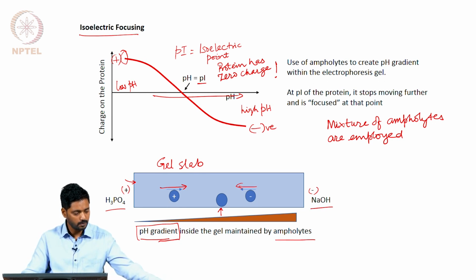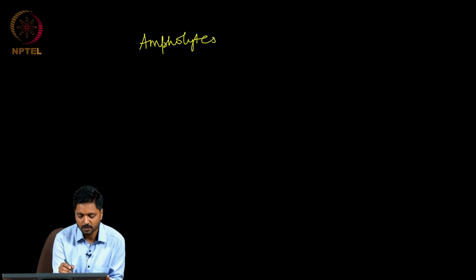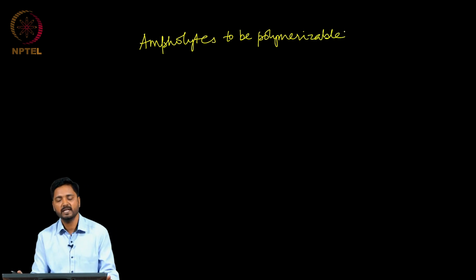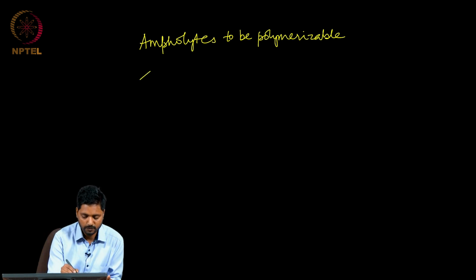So, let us go to the board. Now, these ampholytes also need to be polymerizable, and that is very nicely incorporated in the chemical structure of the ampholytes.